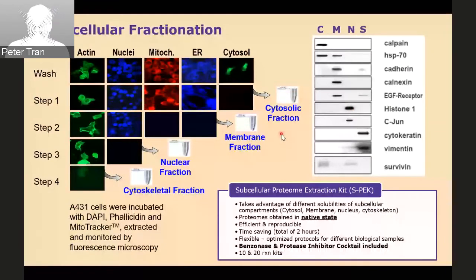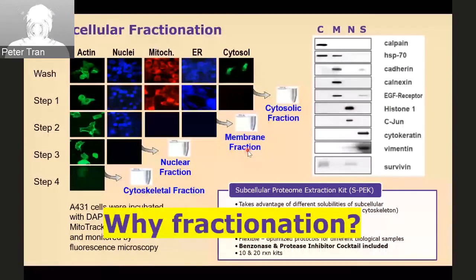But why do we need fractionation? Why do we need to do fractionation? Can I ask you all to go back to the poll and answer the question? Do you use fractionation to examine protein localization, or examine protein trafficking, or to increase detectability of the target protein? Just pick one. What's relevant to your experience? I'll give you a few seconds.